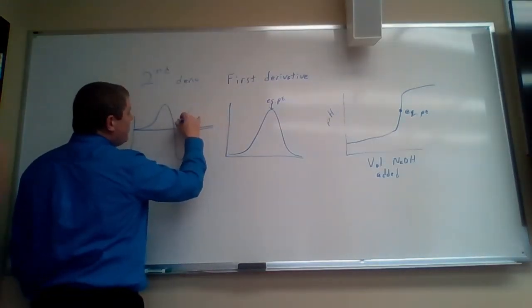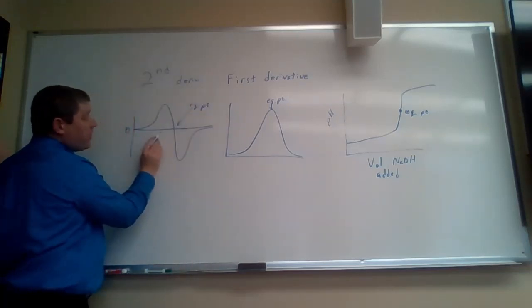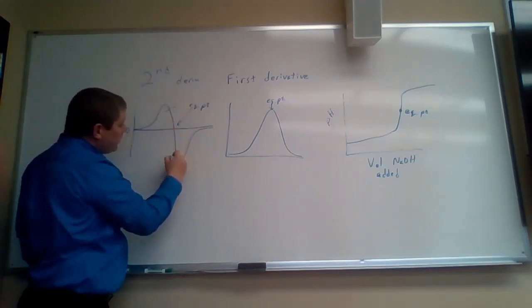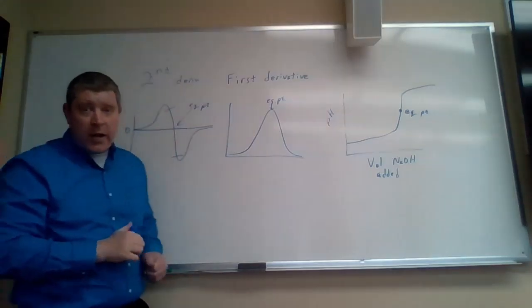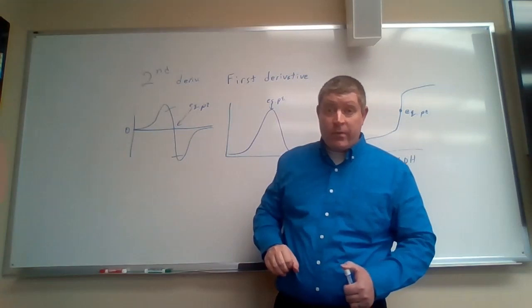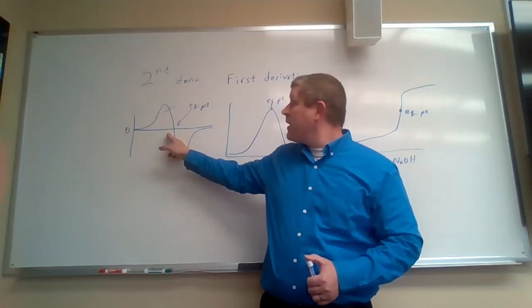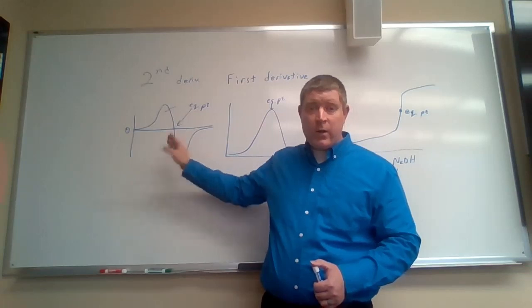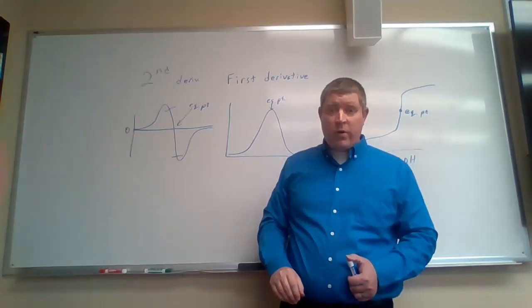So the equivalence point is then this point where we cross through the 0. And this means that it's relatively easy for us to take a section of data in here and plot a linear trend line in there and solve that trend line for y equals 0. What is the x value? What is the volume of sodium hydroxide added? That gives us a value on this second derivative curve equal to 0. And that is going to be our most precise measurement of the equivalence point.